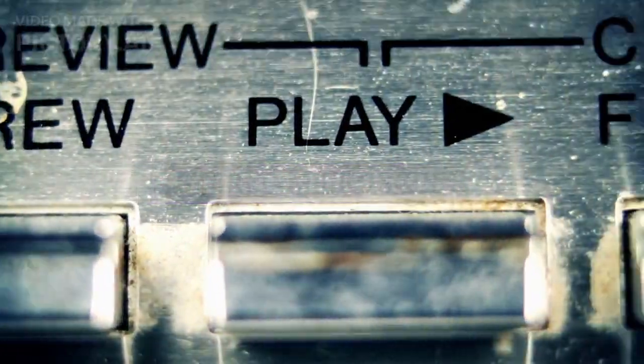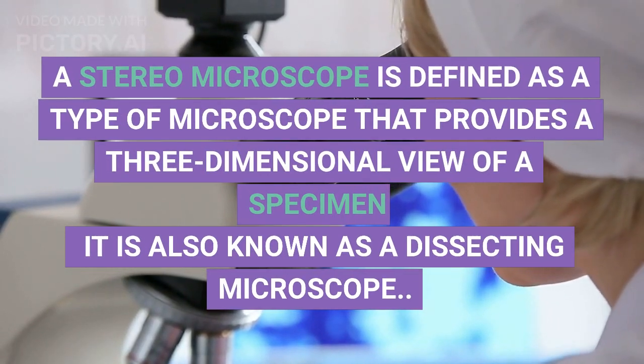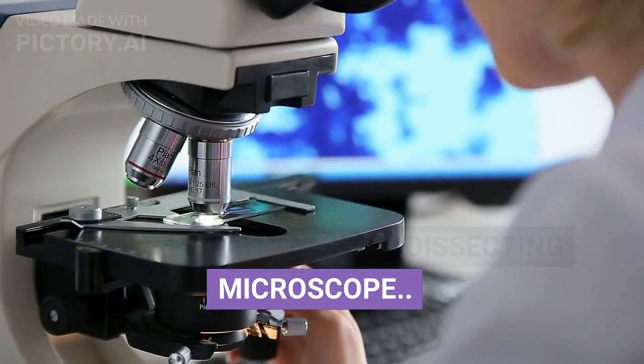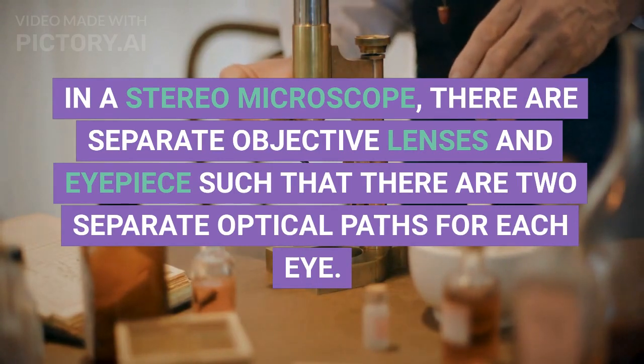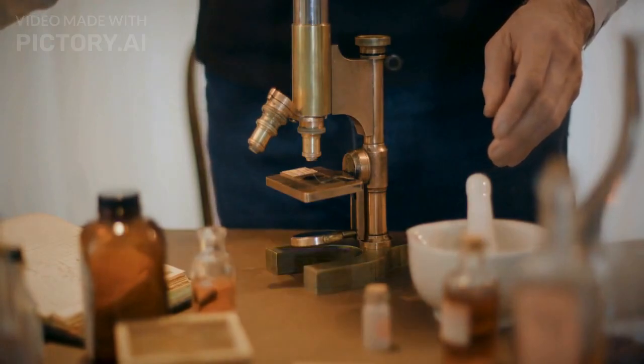Stereo microscope. A stereo microscope is defined as a type of microscope that provides a 3-dimensional view of a specimen. It is also known as a dissecting microscope. In a stereo microscope, there are separate objective lenses and eyepiece such that there are 2 separate optical paths for each eye. Stereo microscope diagram.